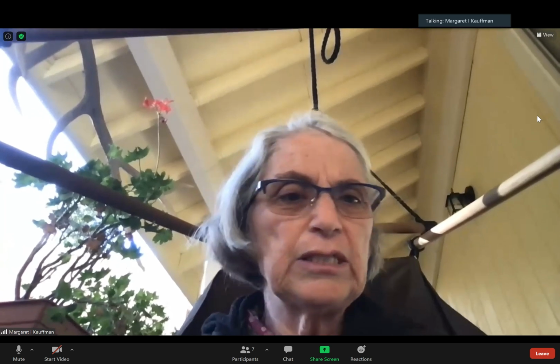Okay. And let's see what other ones. Circular folds. Okay. Let's look into the other window.